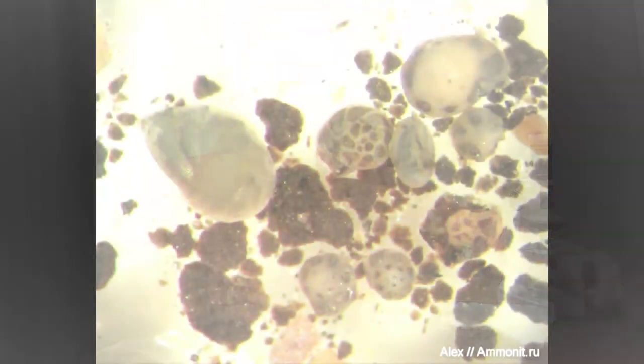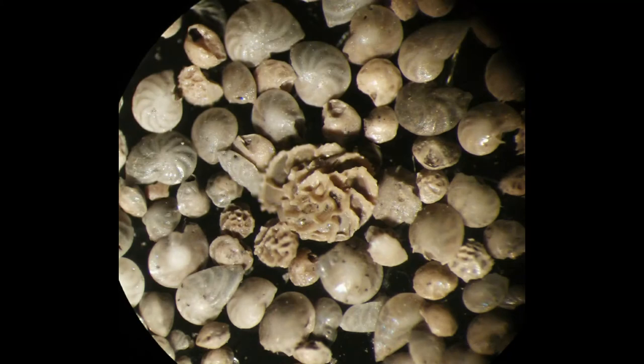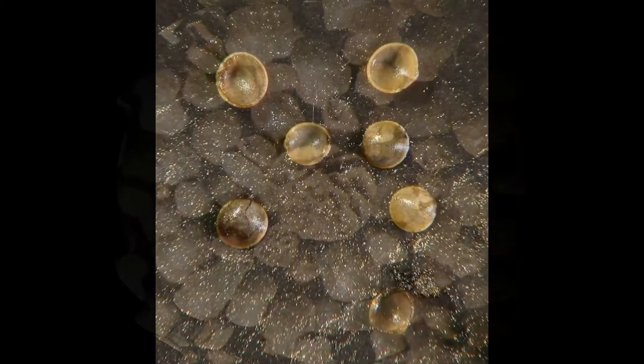И сейчас мы приоткроем окошко в микромир. В сети мало снимков юрских фораминифер — это то, что мне более-менее сносного качества удалось найти. И мы попробуем найти похожий вариант сейчас вот в этих юрских глинах из Маркова. А вот наша стопроцентная фораминиферочка! Похожая на маленького аммонитика или такой маленький пельмешек. Лежит себе. Мы её наконец-то обнаружили.